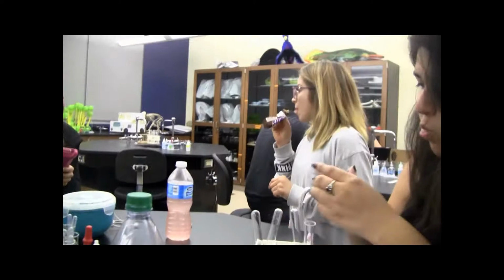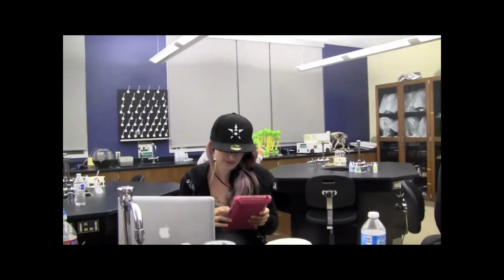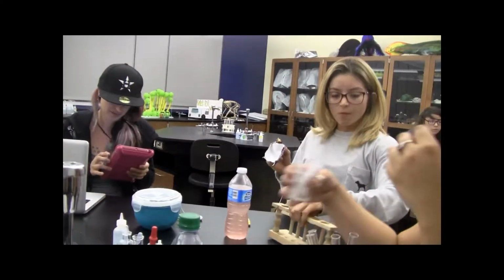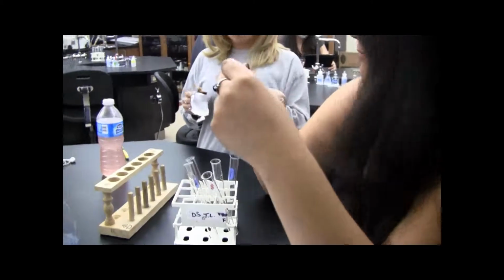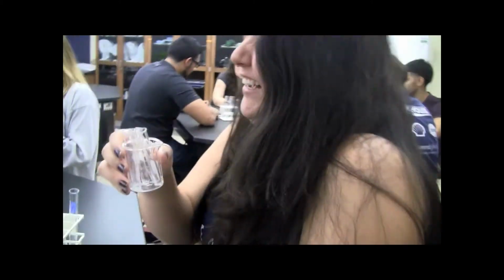Fermentation tubes, 5 per group. Fermentation tubes, you got that, Brenda? Do I have to Google that also? That's just the rack. Oh, test tube rack. How many fermentation tubes? 5. Well, I guess it's these, those little ones. Let me zoom into those. I can just move them towards the camera.